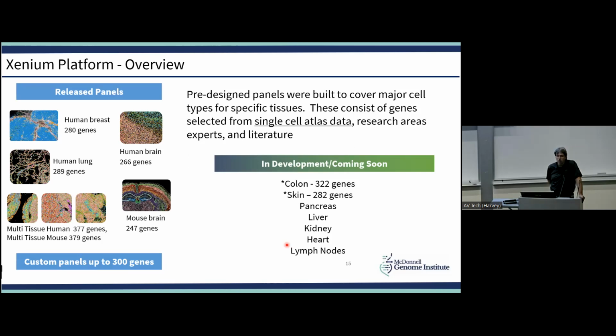So if you're going to target certain genes, it's good to go to some of these single cell databases to see if probes associated with those transcripts have been used successfully in the past, because that can actually be a factor in improving your success rate if you're going to do custom panel design. So that's really the reason I wanted to point this out.